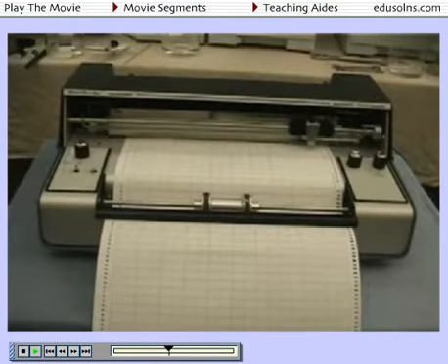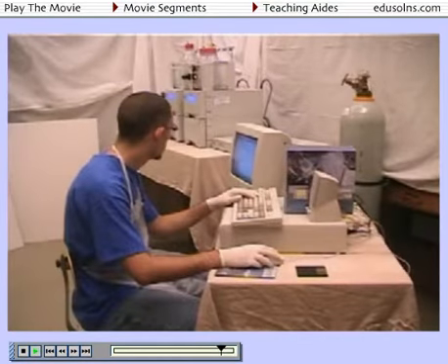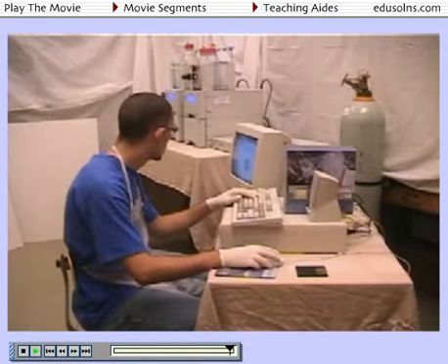Now that the system has performed its job of separating and detecting each compound, we must process this data into information that we can use. Earlier data processors were as simple as the strip charts shown here. When these were used, lab technicians would triangulate the area under each peak, or, more commonly, measure the height of the peak with a ruler. Later, electronic integrators, such as the Hewlett-Packard version shown here, were used to automatically calculate the peak height and peak area. These work well for symmetrically shaped peaks that do not overlap with other peaks, but provide minimal control over integration parameters. The availability of relatively inexpensive computers has made data processing much easier and provides the user with much more control over the way peaks are integrated.